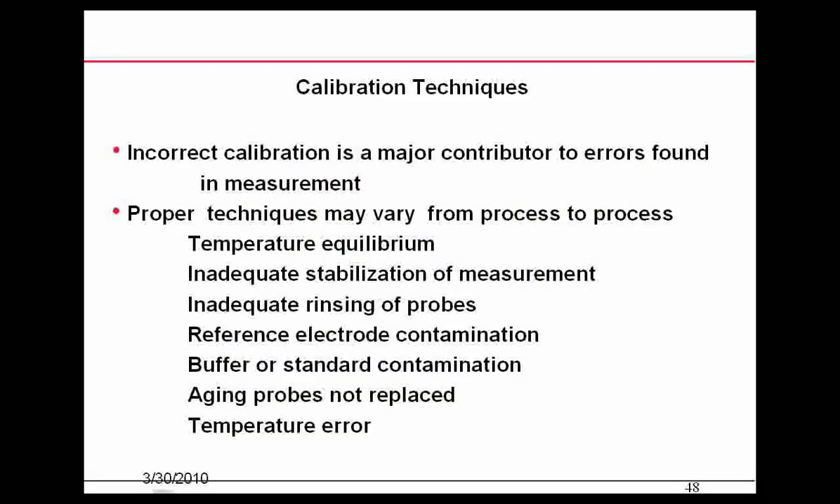Looking at incorrect calibration and some of the bad things that can happen: one issue is inadequate stabilization of the measurement — in other words, not allowing the probe to sit in the buffer long enough. Another is inadequate rinsing between buffers.